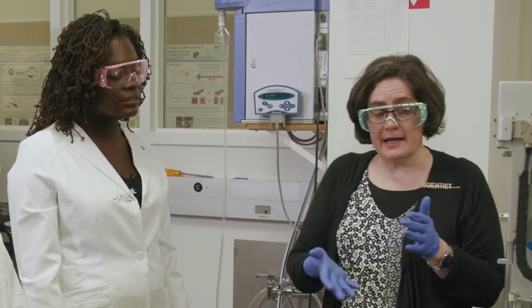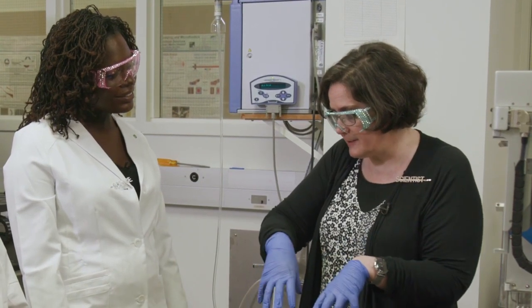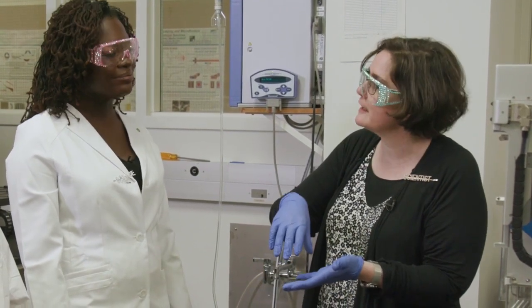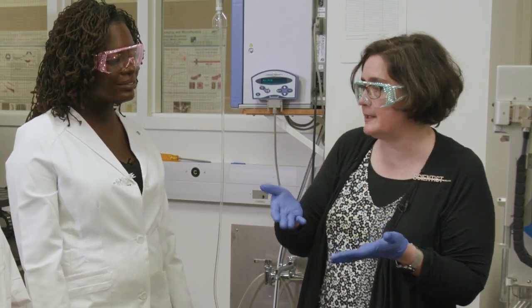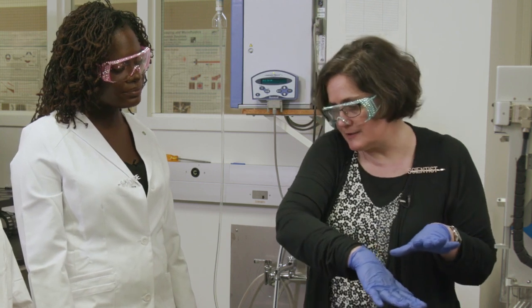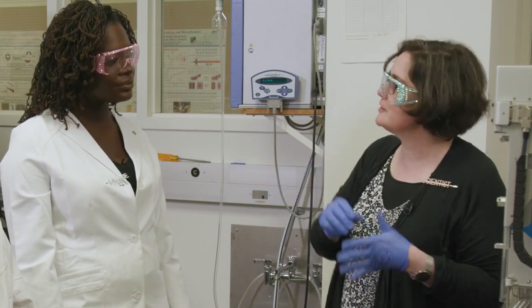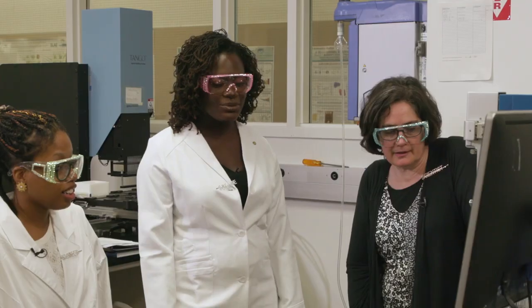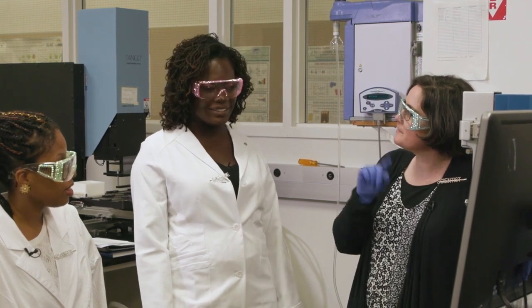Oh, okay. And every time you actually put your syringes down and dispense into something where you're touching other things, you may get contamination or interaction between things. So the fact that we are able to dispense stuff down and then shoot the protein out means that you're never going to have contamination. Okay, so robots. Not taking our jobs, but making our jobs better. Yes.